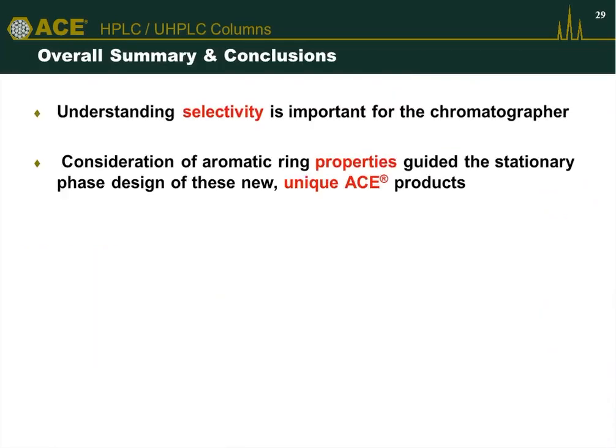So just bringing that all together now and coming towards the end of the seminar, hopefully you've understood why selectivity is so important to chromatographers. I talked about it theoretically in the beginning, and I showed you the relationship between each of the components in the resolution equation, including selectivity. And why selectivity with its almost linear relationship is very powerful.